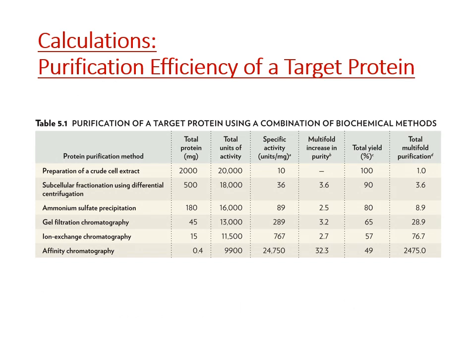So now, when you have purified a protein, meaning you've purified your target protein from a cell mixture where the homogenate had a whole bunch of different proteins, at the end of that, you want to know how efficient was my purification? Did I do a good job? How pure is my sample?